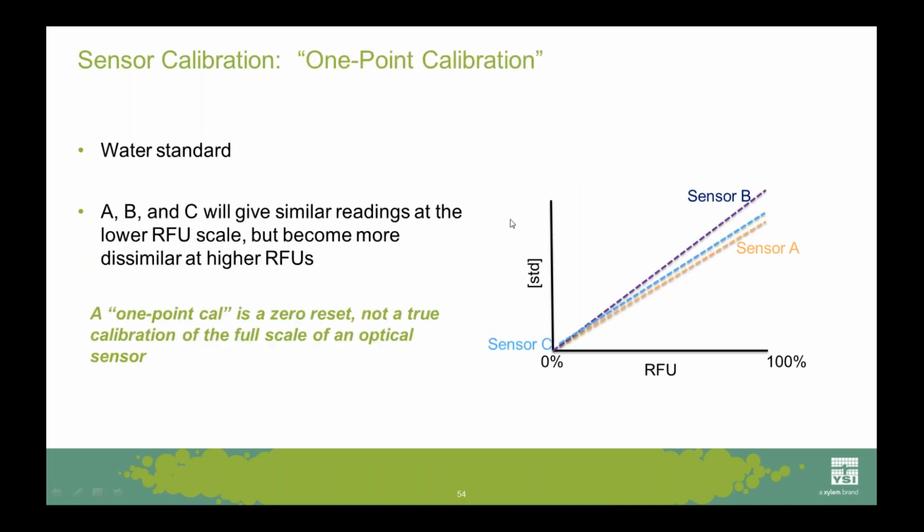So, what does that mean? And I want to address some language that is used in the industry about calibration. You will hear people, even here at YSI, refer to a 1-point calibration. Sometimes we just say a 1-point cal. Oh, I wish we wouldn't do that.